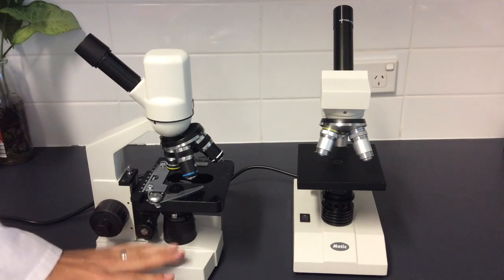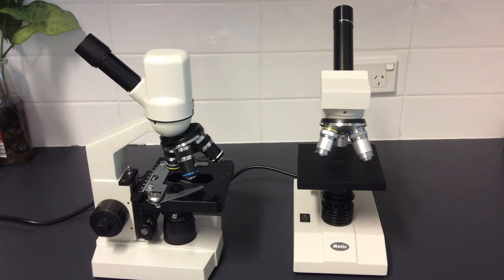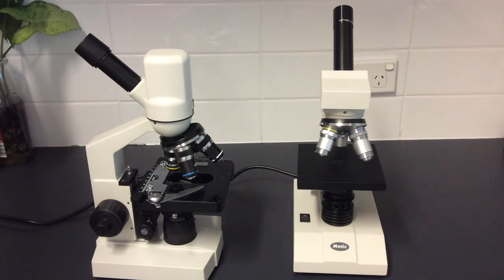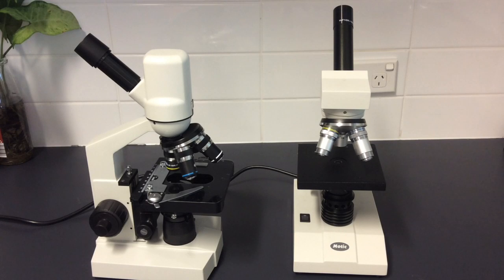So no points for guessing what this part of the microscope is. That is called the base. On the base you're going to find a light. Above the light you've got the stage. The stage is just the platform which the object can be viewed and placed.